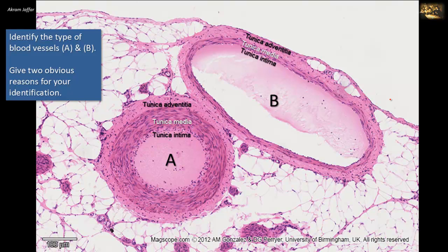In blood vessel A, the vessel is less deformed because of the thick wall in comparison to vessel B. If we look closely, we will notice that the thickest layer of vessel A is the tunica media. A is thus an artery. The elastic fibers are not that prominent in this artery, so it's a muscular artery whose tunica media is mainly formed of smooth muscle fibers. The elastic fibers are condensed in an internal elastic lamina at the border with tunica intima. In larger muscular arteries, an external elastic lamina could also be seen, although it is not very clear in this vessel. Also note that in A, the cellular components of tunica intima are not clear in this magnification.